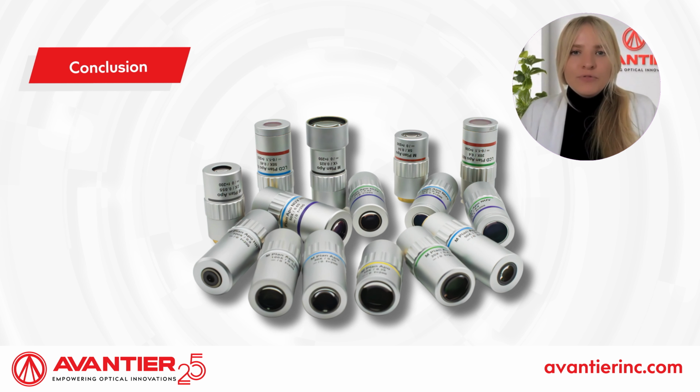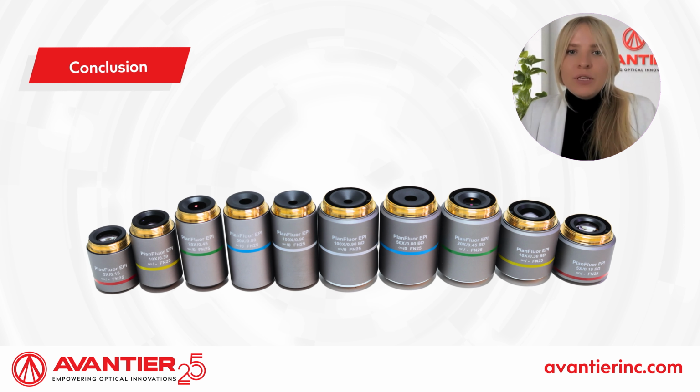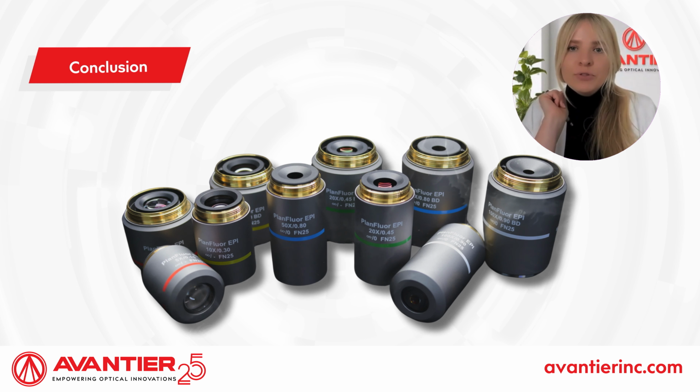Today, we've covered the fundamentals of microscopes, from the key specifications of a microscope objective lens to advanced illumination techniques. Both objective lens and illumination setup play critical roles in a microscopy imaging system for providing high-quality magnified images that are essential for scientific research and groundbreaking discoveries across various fields.